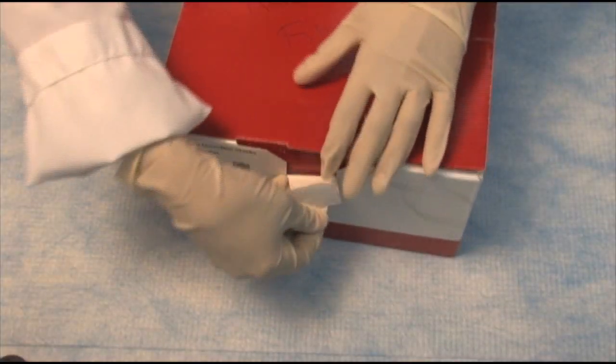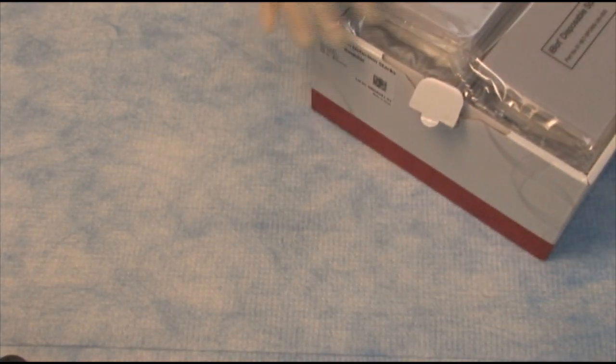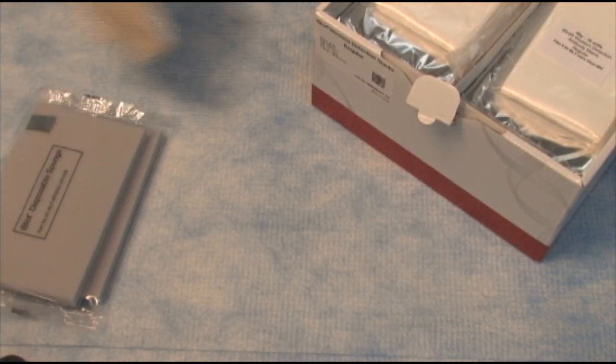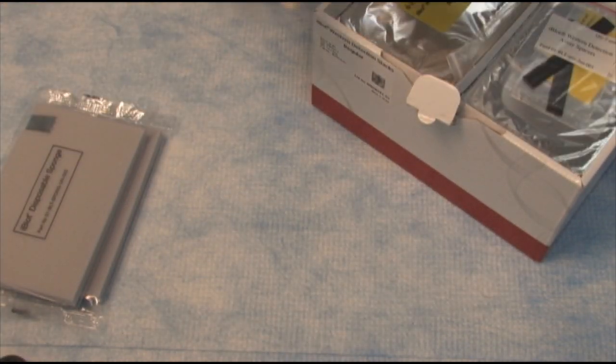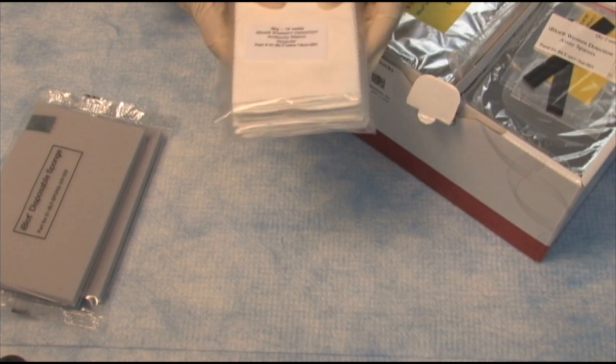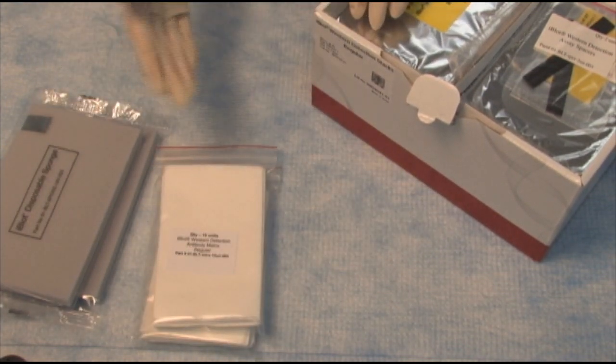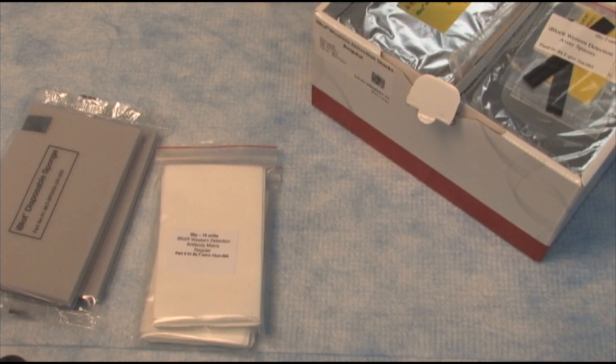Now let's see what we get in the box for the iBlot Western detection stacks. We have some sponges here. These go into the lid of the iBlot device. We have some matrices. And these are what are used to put your different solutions on, your antibody, your blocking solution, and so on.